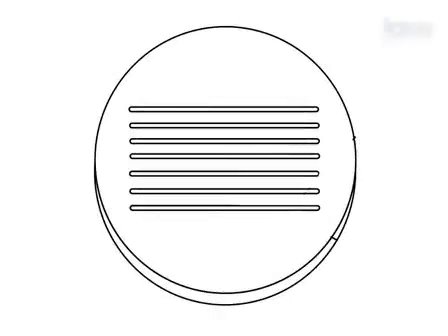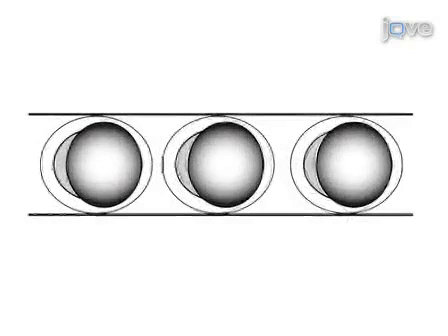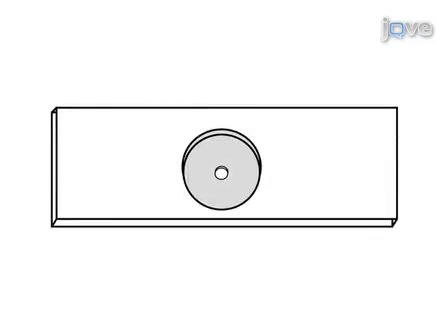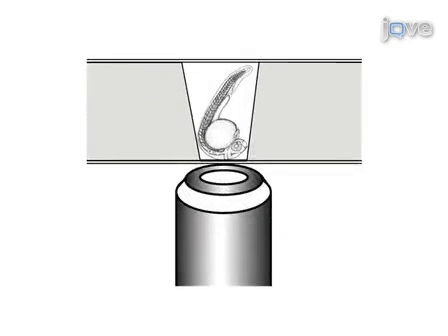This procedure begins with injection of a single cell zebrafish embryo positioned in an injection mold such that the cell is oriented facing away from the injection apparatus. The embryos are then injected with mRNA, with the needle moving through the yolk and into the cell. The next day, a plastic mounting slide is filled with agarose. An anesthetized embryo is then placed, inverted, in a hole in the agarose and imaged by confocal microscopy.